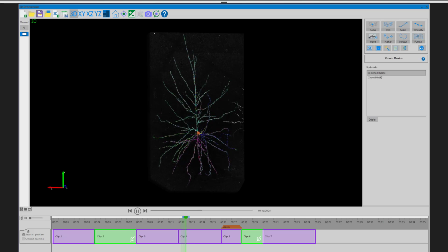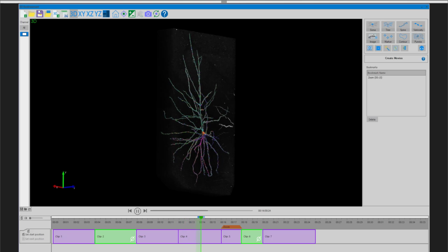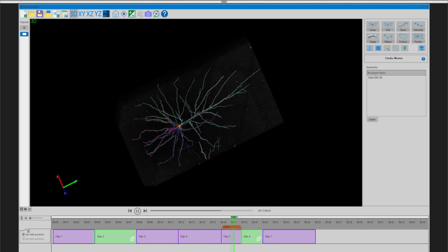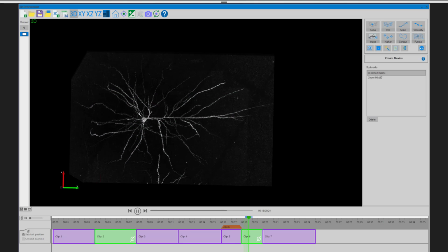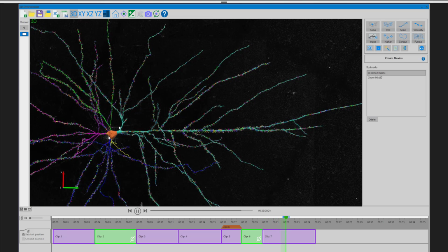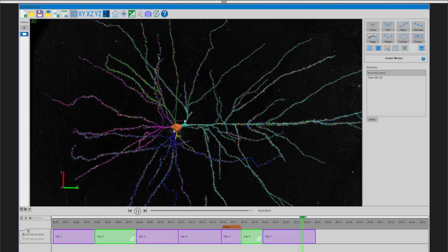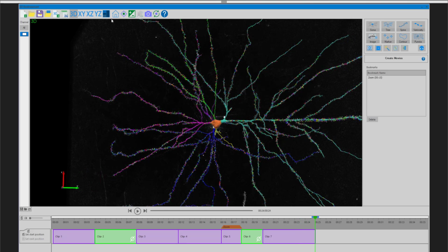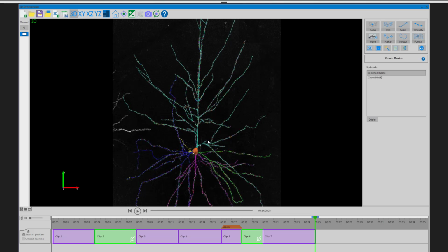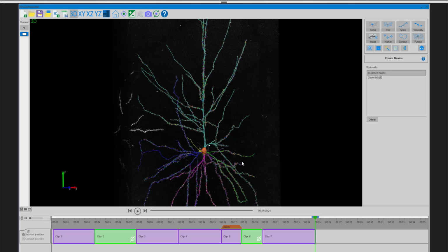Ooh, that's a great question. So Espen asked, is there any way to make a "fly-through" in the dendritic tree? With the way the automatic movie motion is going, I haven't had any success in doing a sort of fly-through. My guess, Espen, though I might be incorrect in this interpretation, is that you mean if we were to zoom in, is it possible to move through the tree so that we poke out on the other side and still visualize it in that sense?